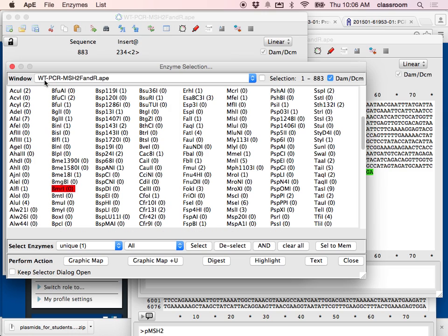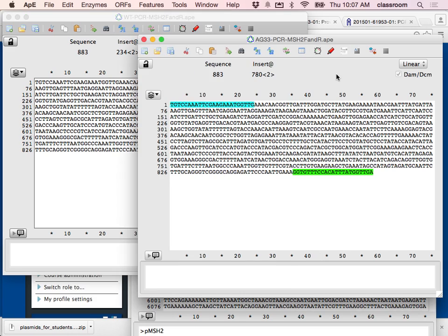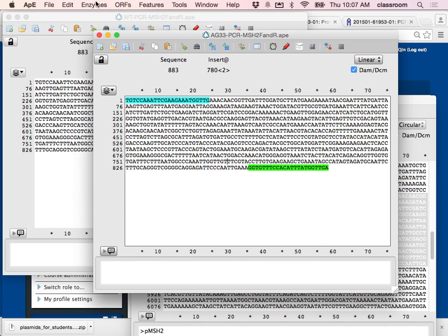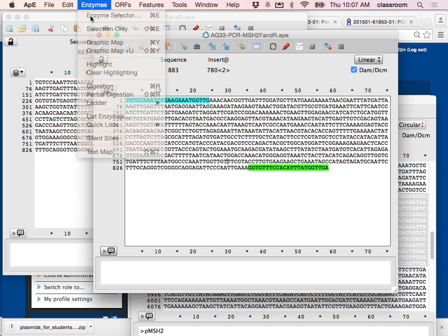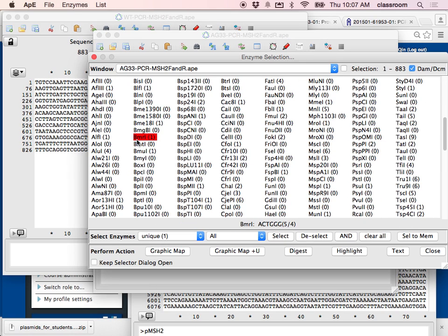BMR1 does not cut the wild type, so if I did a digest on the wild type I would see one band at 883 bp. Now I go to the mutant and do the same thing. Checking BMR1 for the mutant — this time I see it cuts once. So if I do PCR on both wild type and mutant and cut with BMR1, it will only cut the mutant, not the wild type — that's how we can distinguish which is which.